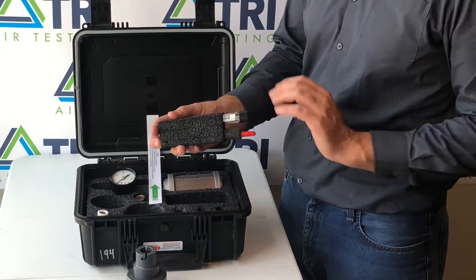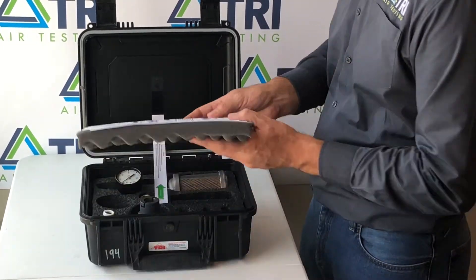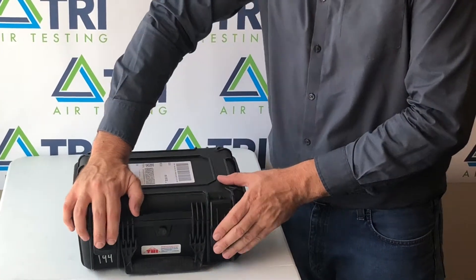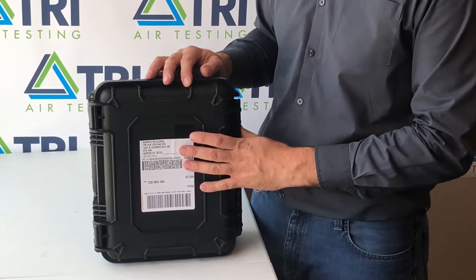At the completion of sampling, return all items back to their original location in the test kit. Close and secure the kit. Fix your shipping label and return to TRI air testing for analysis.